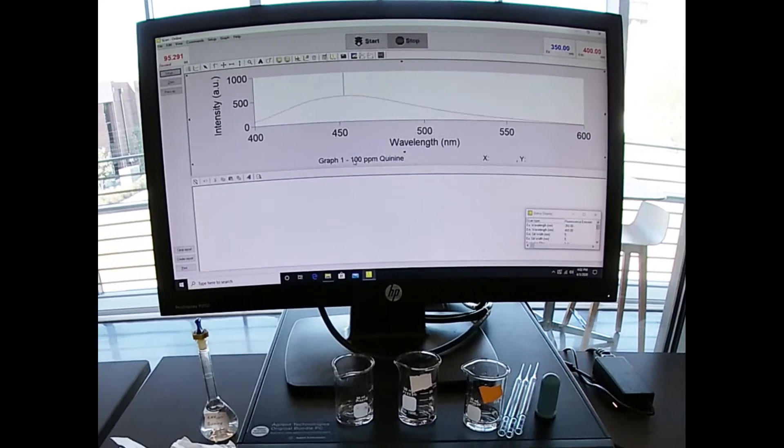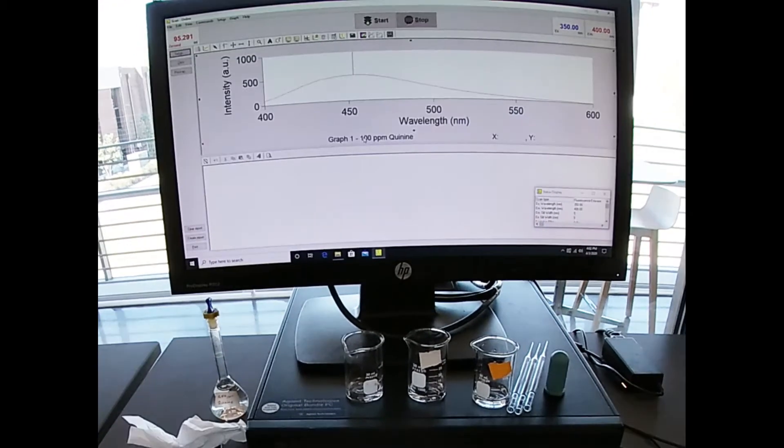That's most likely where we're going to be measuring, but we'll do a scan for each of our samples when we do our analysis.